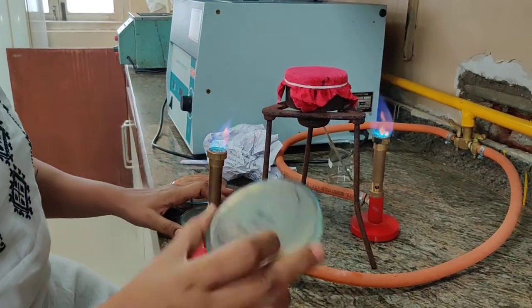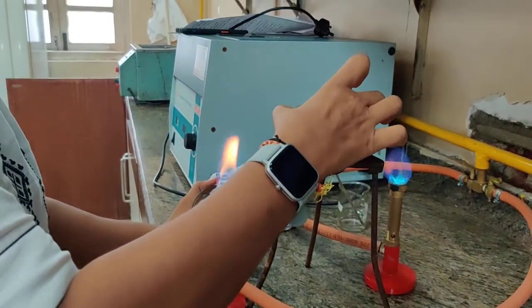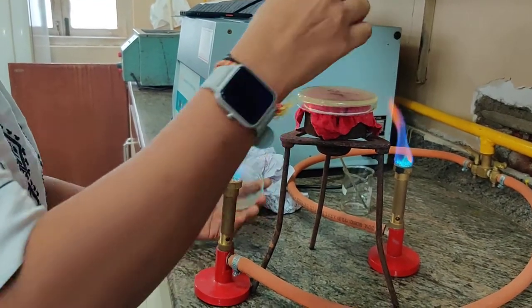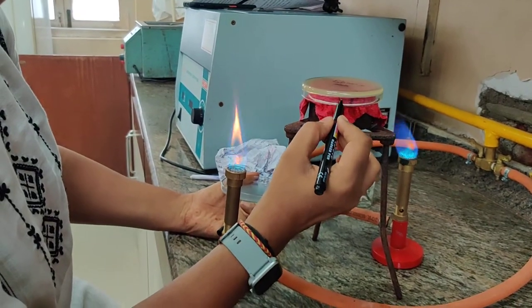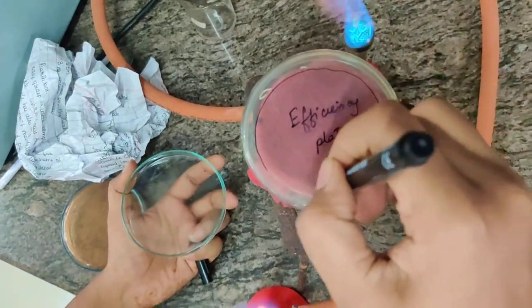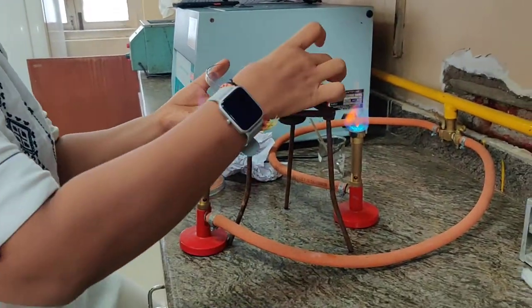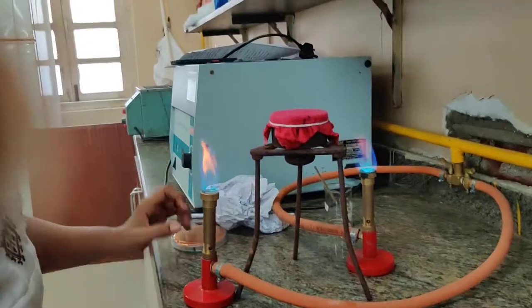Our replica plate is now inoculated. Next, we take the efficiency plate and do the same as we did for the replica plate. The efficiency plate is now inoculated as well.